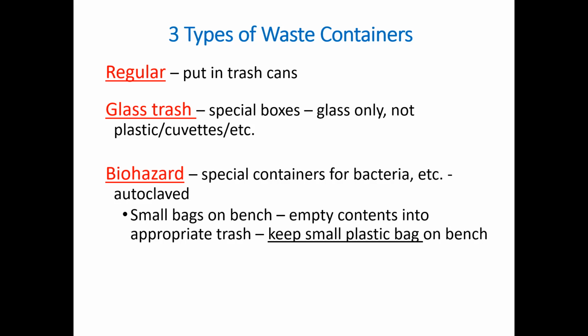Most days, when we're not working with biohazard, you can simply empty this into the big trash bins, keeping the plastic bag, since we try to limit the use of plastics. Once we start working with biohazardous material, we'll empty those into the large biohazard container and eventually remove the bag because it's been in contact with biohazards, and put out a fresh one for regular trash.